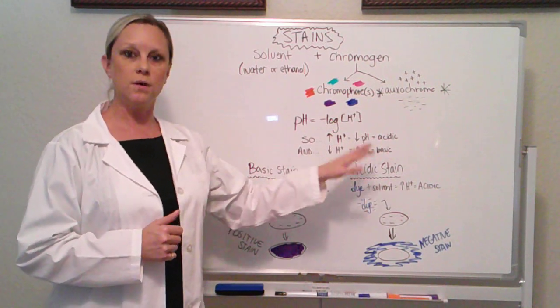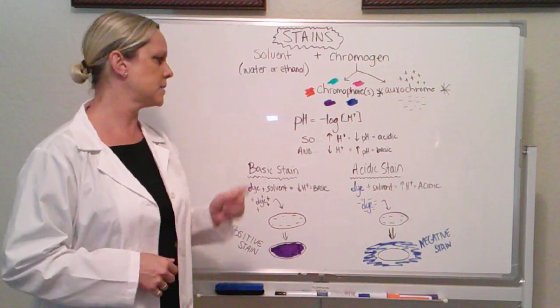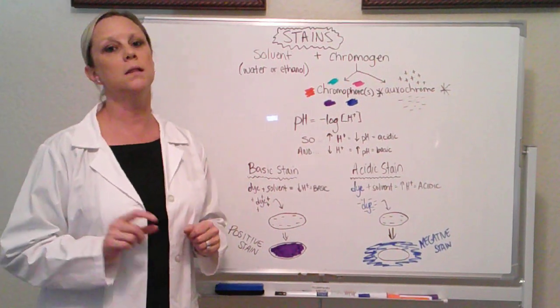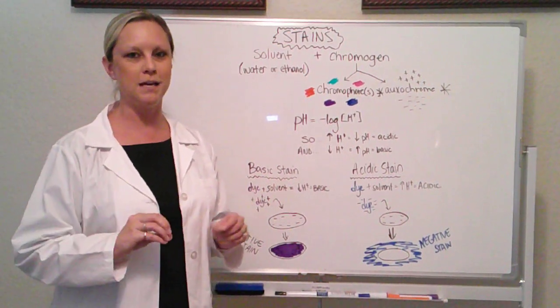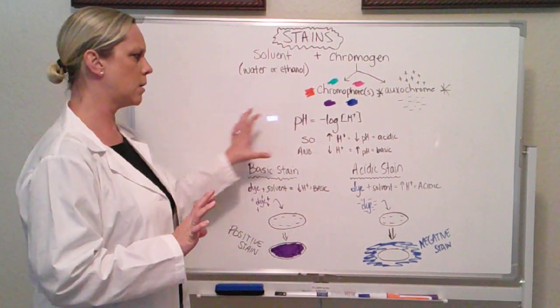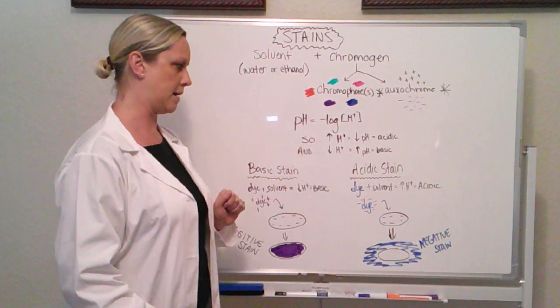Before I get into talking to you how that actually works and what that interaction looks like with the bacterial cells, I do want to back up and talk to you a little bit about pH. Don't panic, you're not going to be having to calculate any pH of these staining solutions. I just kind of want to walk you through this so that you get a better understanding for why these are named the way they are.